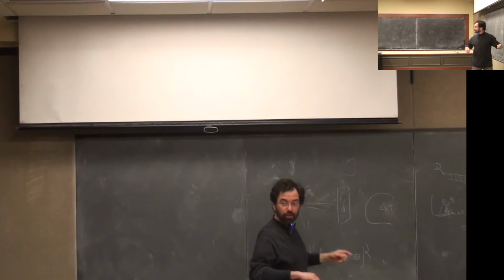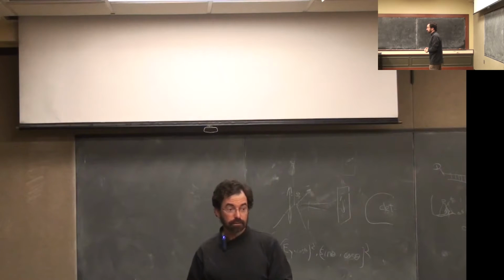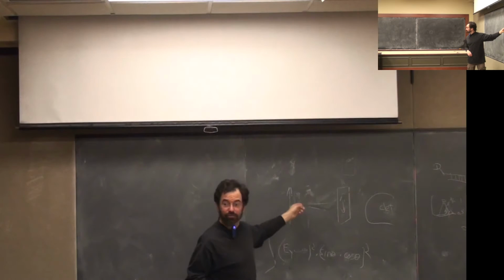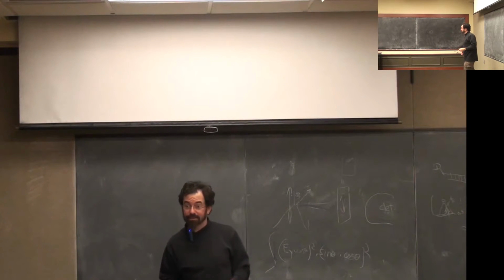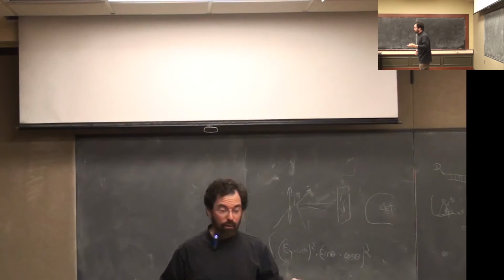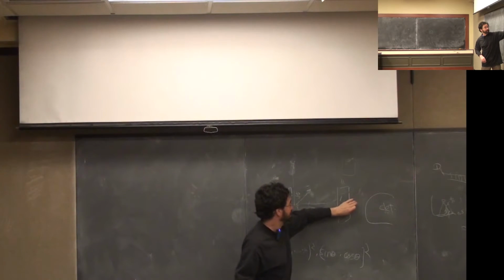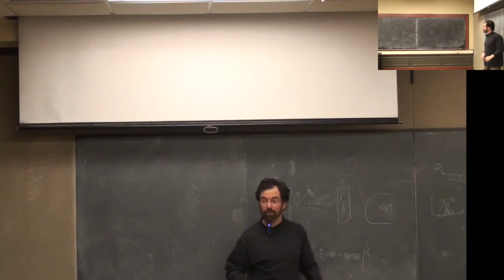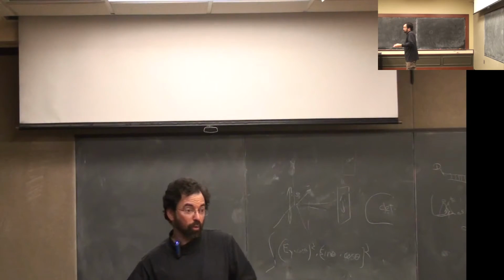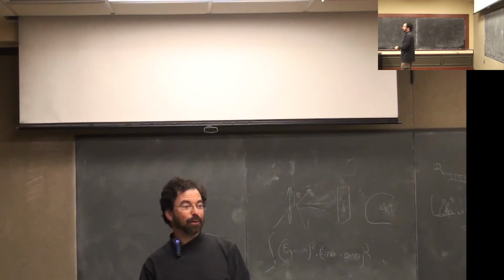And now let's look at if the thing is rotating during its lifetime. Well, let's say this is rotating really fast compared to its excited state lifetime. What will it actually look like in terms of the detector? The amount here and the amount coming in here. Will one be greater than the other? Or will they be the same, or 0, or whatever? What do you think, Lydia?